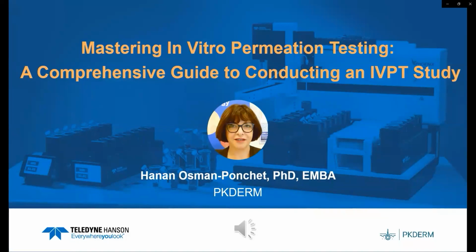You will see during this webinar how to prepare skin samples, how to prepare diffusion cells, and you can see how to make topical application, and finally, and this is the most important step, how to separate stratum corneum, epidermis and dermis at the end of treatment period. So let's go.